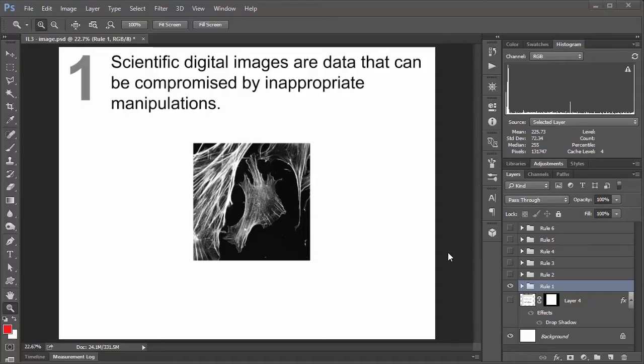Okay so rule number one. Scientific digital images are data that can be compromised by inappropriate manipulations. And so the idea behind this guideline is that you got to remember that anytime you take any kind of digital image, at the end of the day it's just a bunch of pixels. And every one of those pixels is going to have some sort of value associated with it.